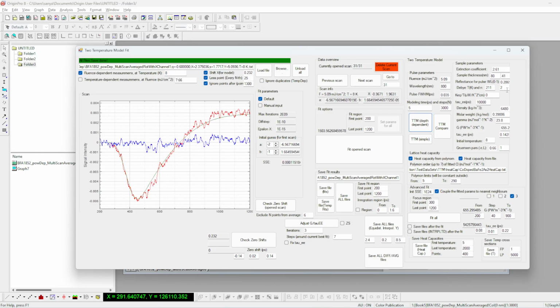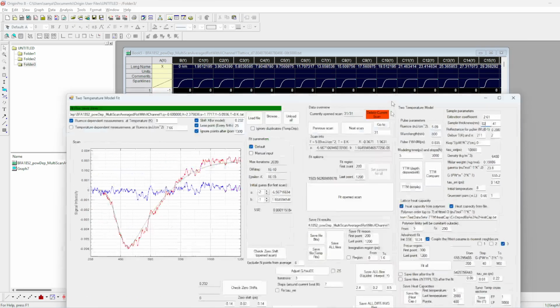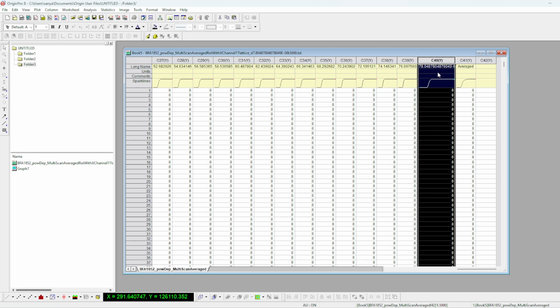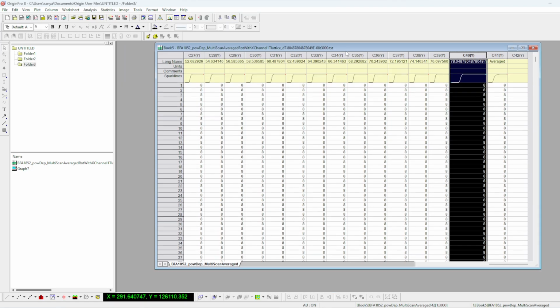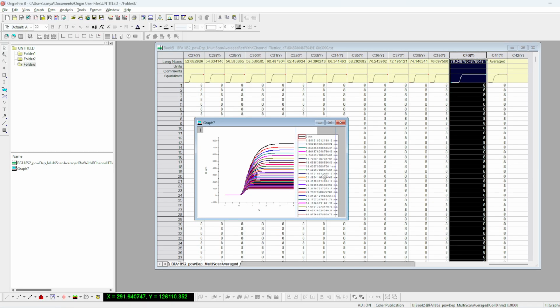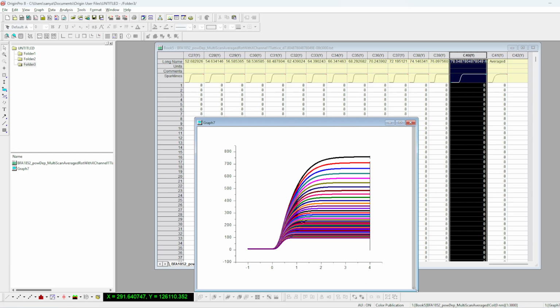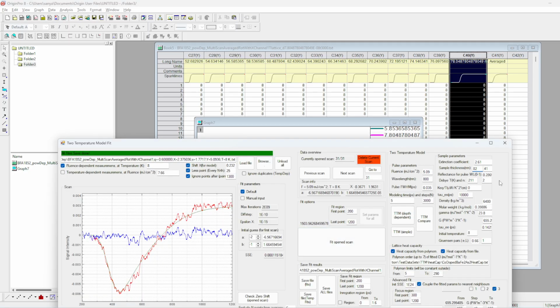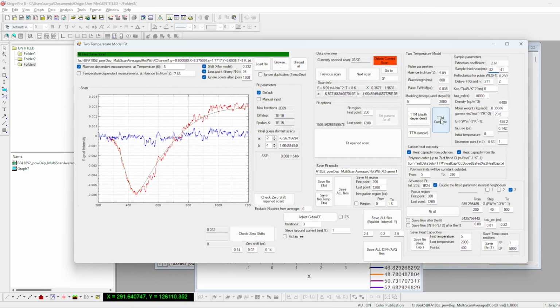My recommendation when using it: if I go for 41, for example, I want to increase the sample thickness a little bit to have the last layer exactly at 80, because in this way I calculate only on one side of each layer, but then I will calculate on another side. It does not affect the overall model too much, because I calculate for each layer individually. I do not use the entire thickness, unlike the regular, not depth-dependent model.